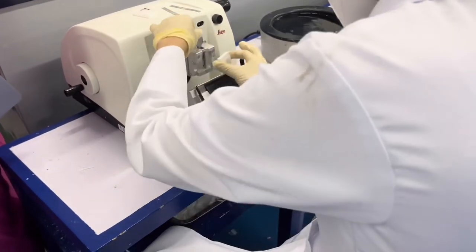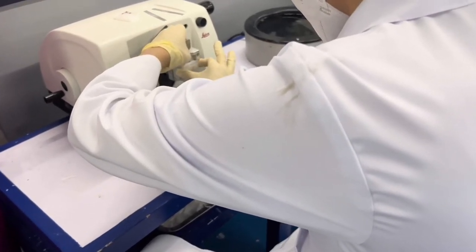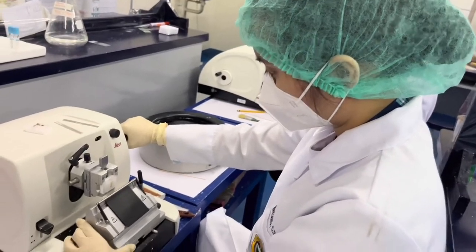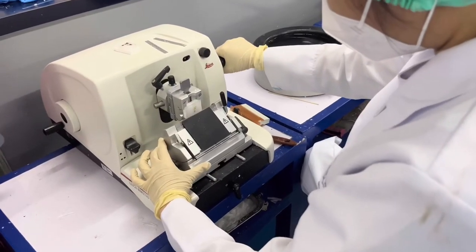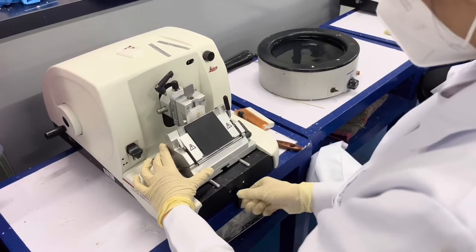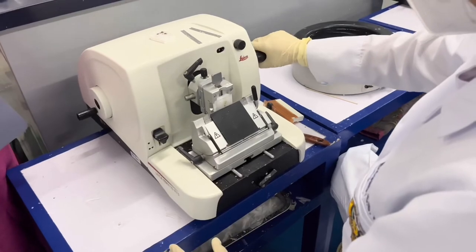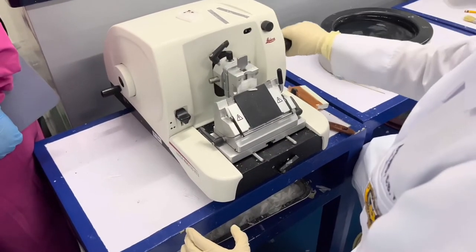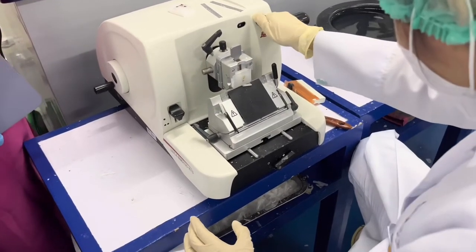First, put the tissue block into the tissue block holder properly. Adjust the blade base holder together with the tissue block holder, making sure that the blade and the tissue block touch. Then lock the lever of the blade holder base. Start turning the wheel at 5 microns, then change it to 10 microns in thickness.